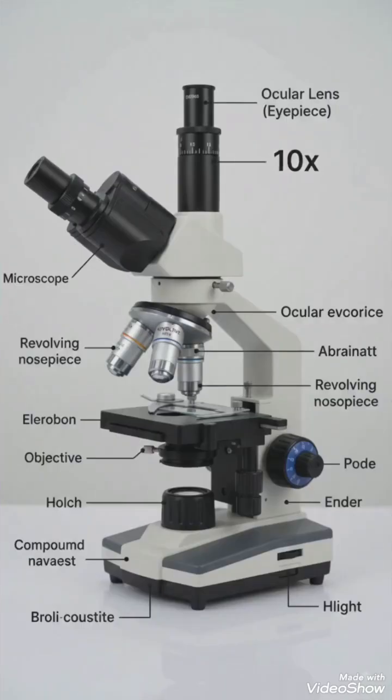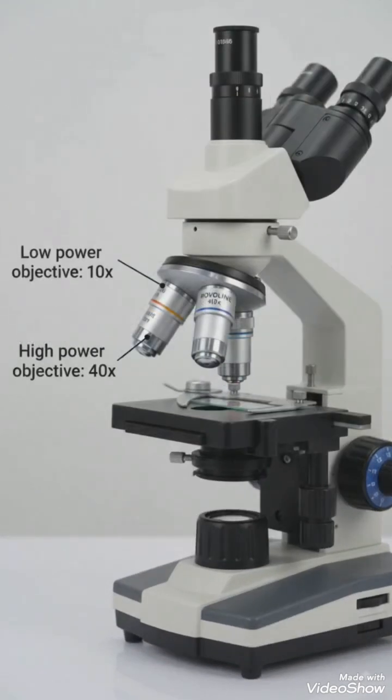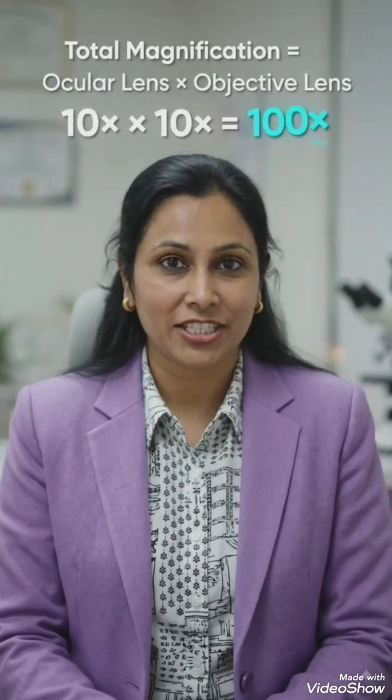The magnification of a compound microscope depends mainly on two lenses. Low-power objective lenses are mounted on the revolving nosepiece, and the oil immersion objective is 100x. Total magnification is ocular lens times objective lens.